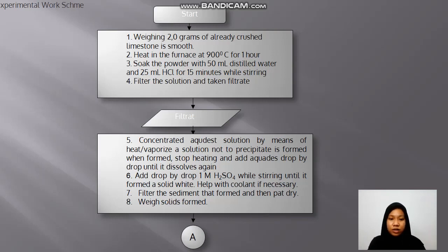Number 7, filter the sediment that formed and then pat dry. Number 8, weigh the solid formed.